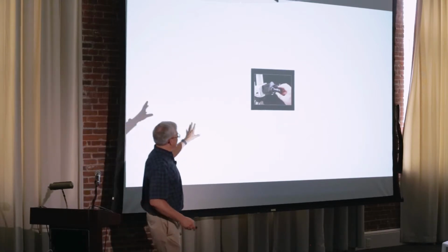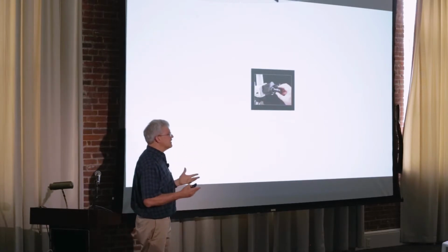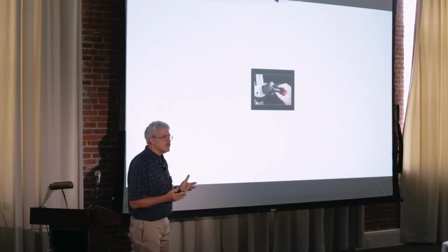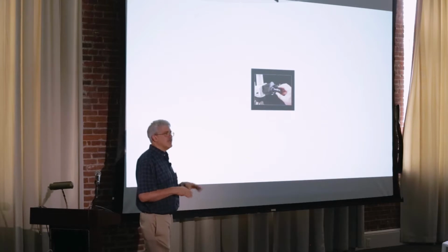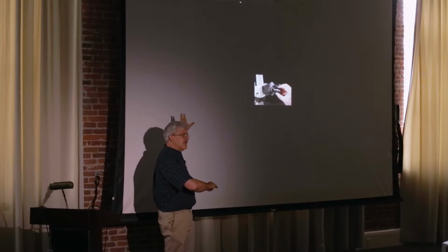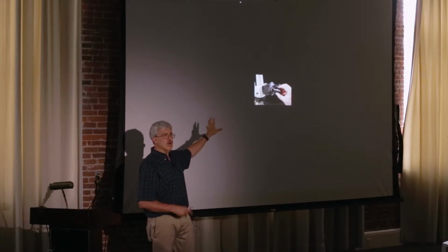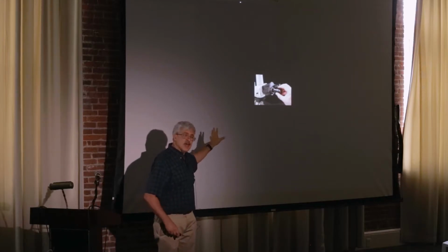And what's happening is all that extra light is bouncing around in your eye or through the system and kind of filling in the shadows and lowering your contrast and doing nasty things to your image. So what do you do? You take some black card and you basically cover up all the white. And now you have a nice clean image of whatever your slide was. You don't have all that extraneous light in the way getting in your eyes, and you can get a much sharper, better contrast view of your sample. That's what the field diaphragm does.